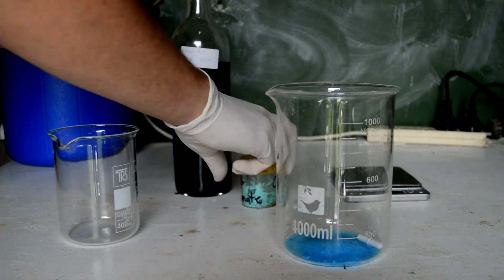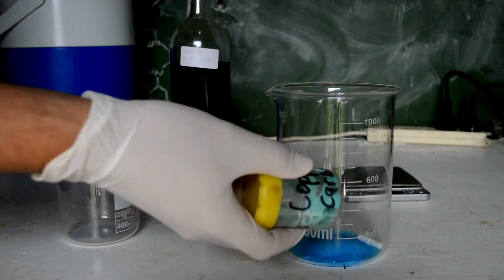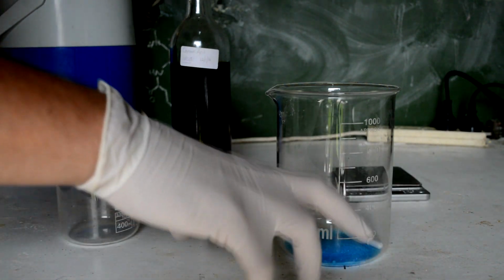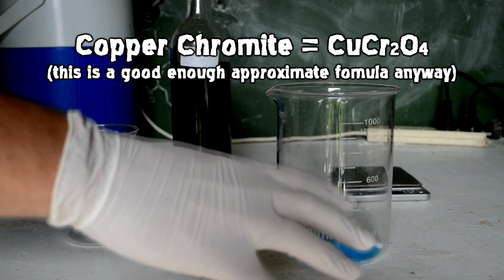But anyway, when you use the basic copper carbonate as a catalyst, you get yields from niacin of about 40 to 50%. What you can do instead is make a copper chromite catalyst, and that's a lot better catalyst, and you get yields in the 80s to 90s.